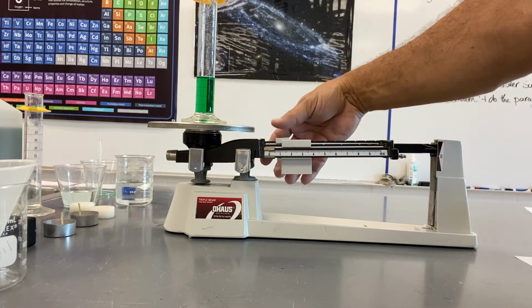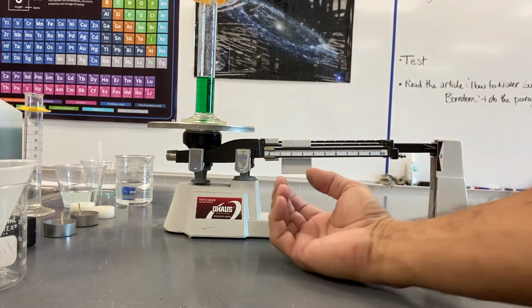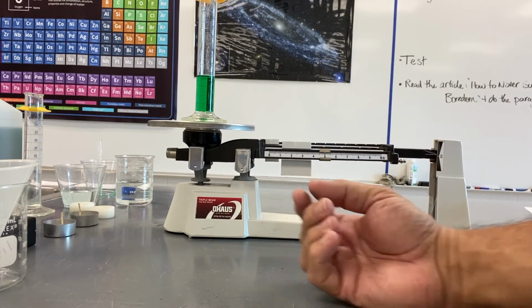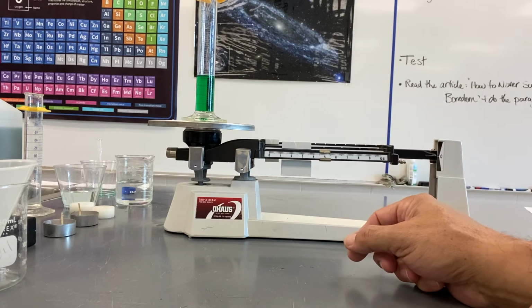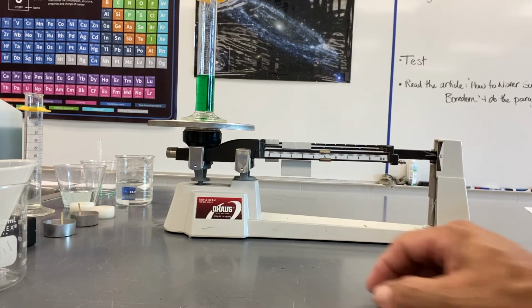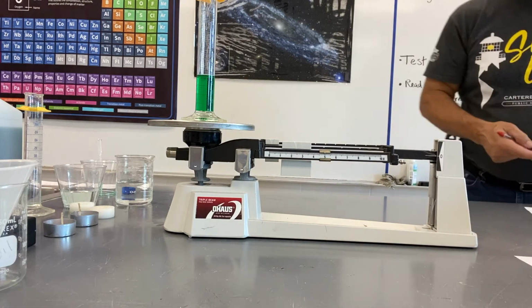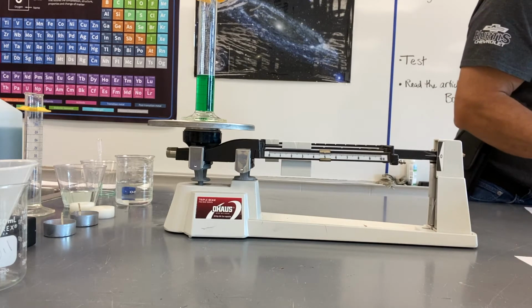Can we go to 110? No. All right, so here we go, back to our ones again. Start at 5 and see where we need to go from there. Ooh, it's looking good so far. I think we got lucky right on the top. All right, so we've got 100, 105 right on the money there. So that's what we're going to record on our table now, 105. And this is alcohol, so that's the second column.